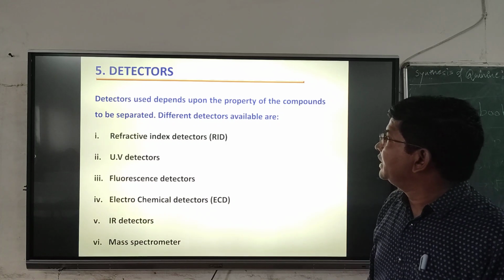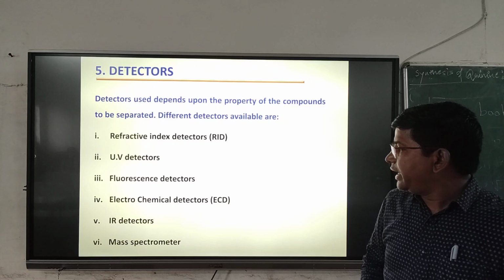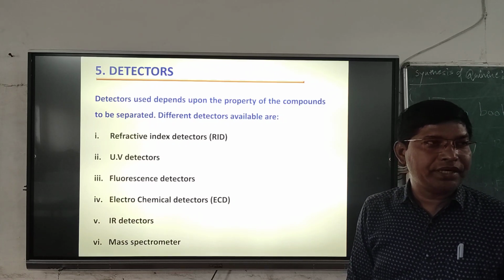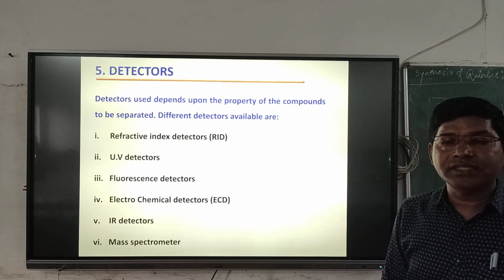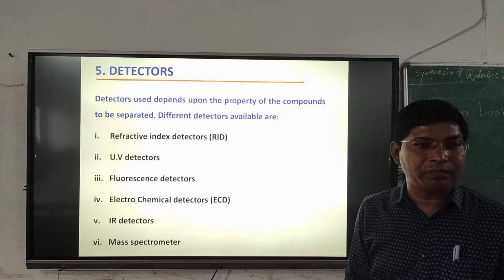Then first we will see the detector. Several detectors are used, and the function of each detector differs, because compounds have different properties.